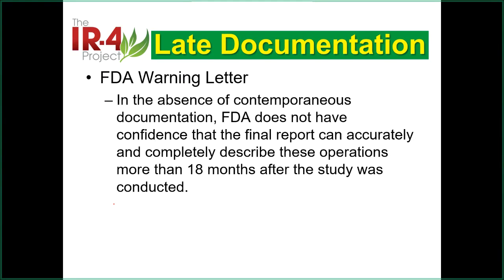If this number changes a little bit, you're going to affect the final results. So in this case, the FDA finding is that there is an absence of the raw data. If you don't see any data there, then, well, this is very wordy, very formal written, but FDA will not trust your work, okay?